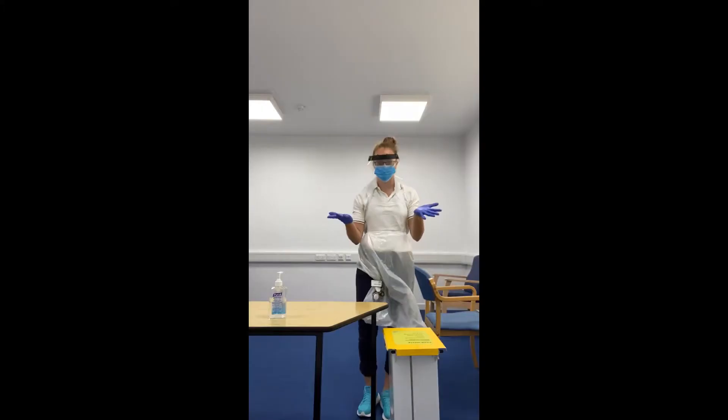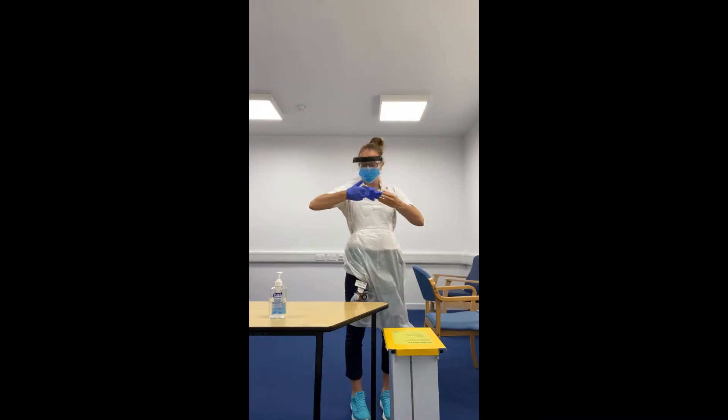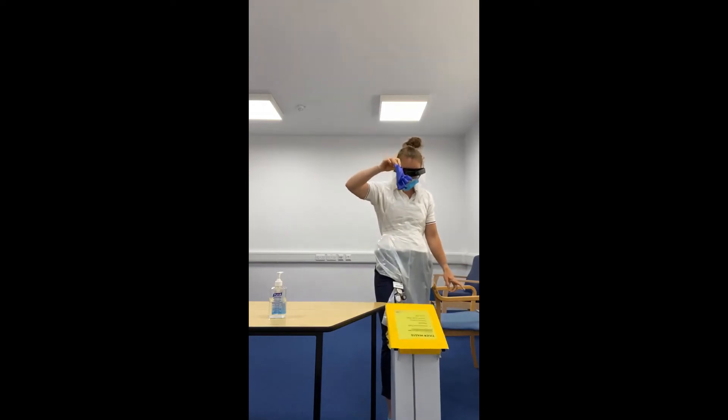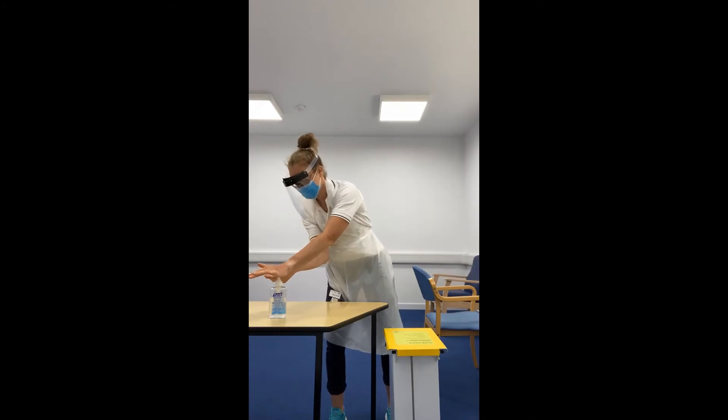When doffing your PPE, we start by taking our gloves off. Use your glove to take the dirty side of one glove, and then use your finger to go on the inside of the other to pull the glove off.